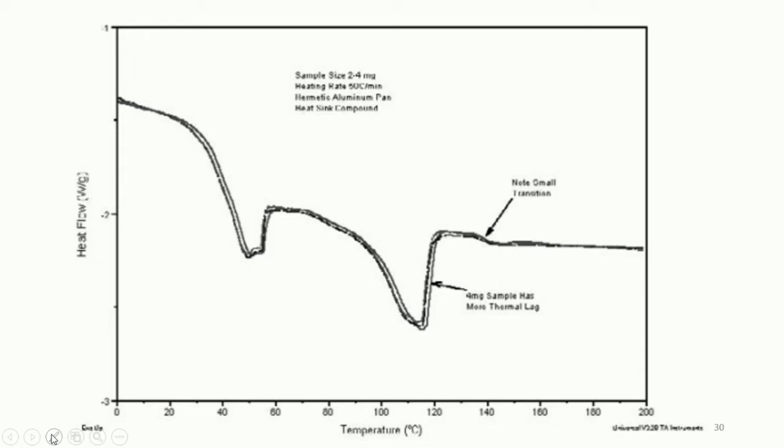TGA or thermogravimetric analysis data of the compound will show that the polymer microspheres, without drug, are usually essentially fully decomposed at near 400 degrees Celsius, where the rate of weight loss is minimum. This is in contrast to the microspheres with the drug, which are still losing weight at a relatively high rate due to ongoing decomposition of the drug.